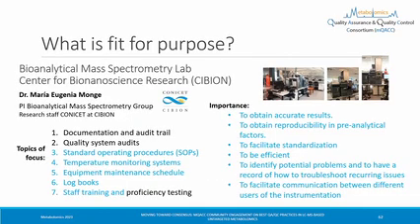So a wonderful archetype: what I did was I polled internal to mQACC. I asked people, what are you doing? Just give me some examples. So this is a limited set of examples from people who responded positively within the mQACC organization. I'll show you just some examples, okay? So our very own Maria here in the front row, say hi. I asked the question, which one of these things that we just went through do you really feel you excel at? And she gave what I think is an archetypical answer here. I focus on SOPs, I focus on temperature monitoring, I focus on maintaining my equipment and maintaining a schedule of that, logbooks, and staff training.